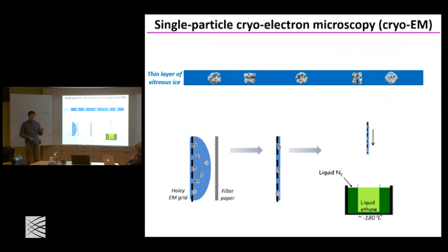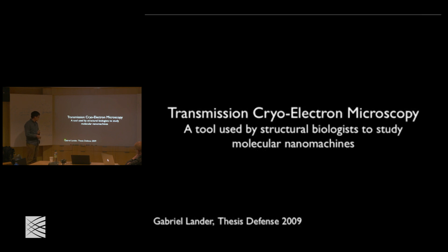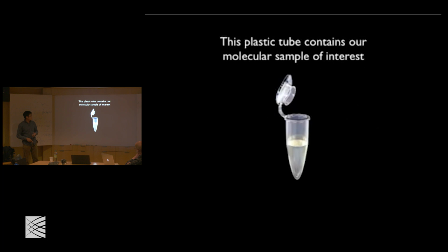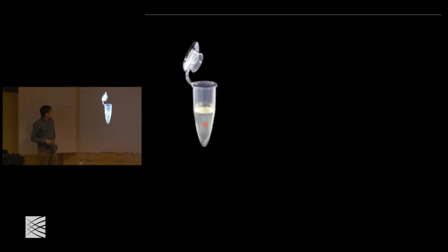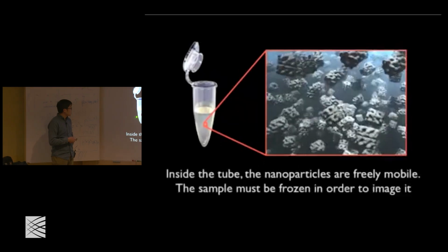Next, I'll use a video to show you exactly how this is done, and hopefully it will give you more ideas about the size of everything. It's actually a thesis movie from Gabe Lander, currently at UCSD. So here is the sample.